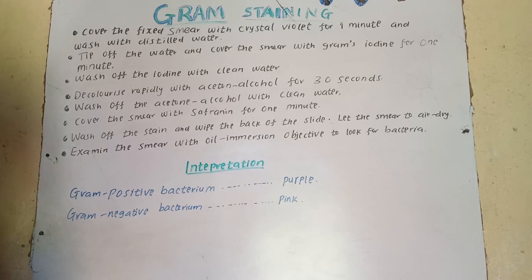Cover the smear with safranin for 1 minute. Wash off the stain and wipe the back of the slide. Let the smear air dry. Examine the smear with oil immersion objective to look for bacteria.